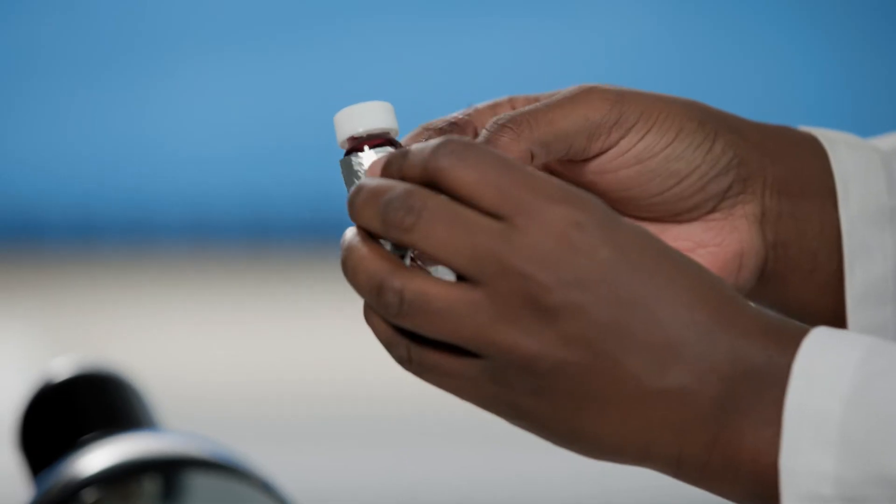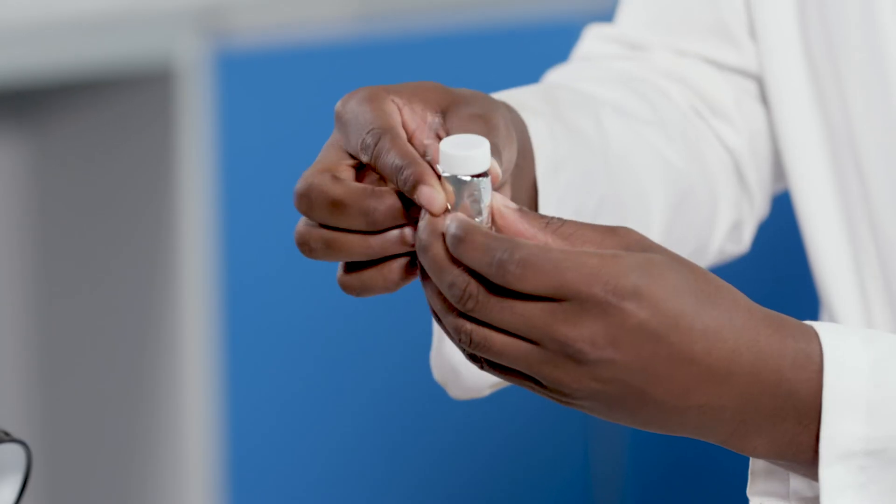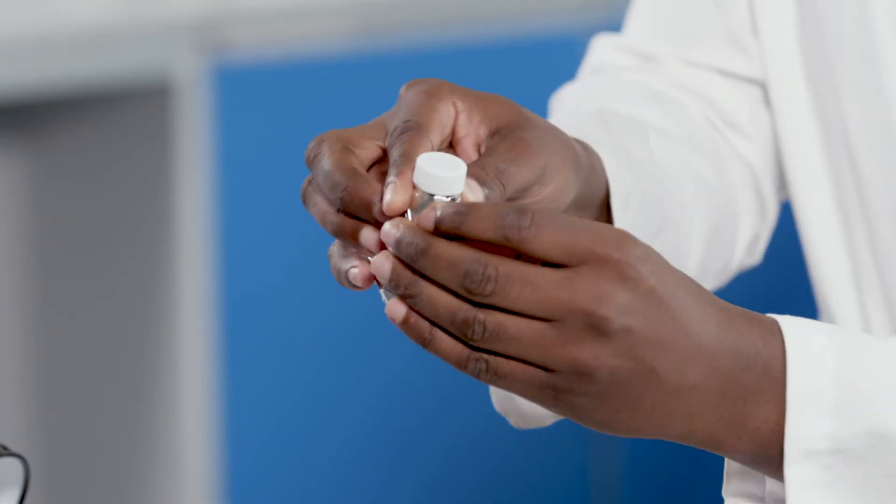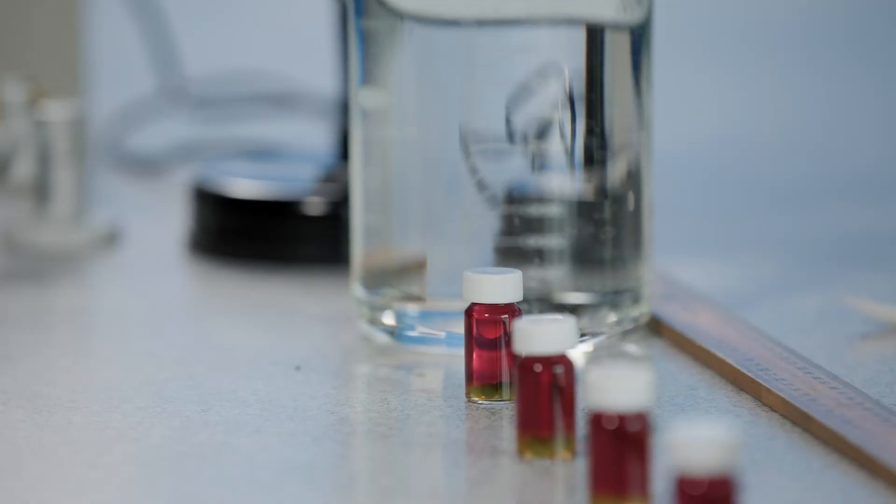To set up your negative control, cover one bottle in kitchen foil so that it's in the dark and place it next to the bottle that is closest to the lamp.